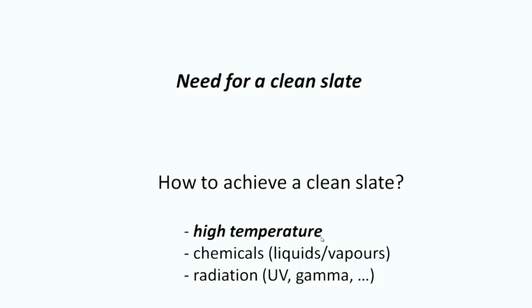So, let us move further in this lecture. From this point, we will look at high temperature in some details of achieving a clean slate, or sterilization as it is called, using high temperature.